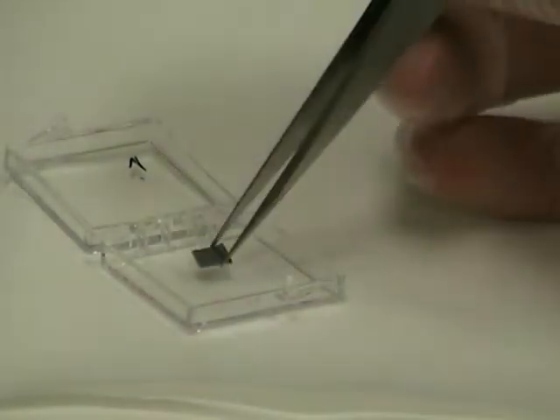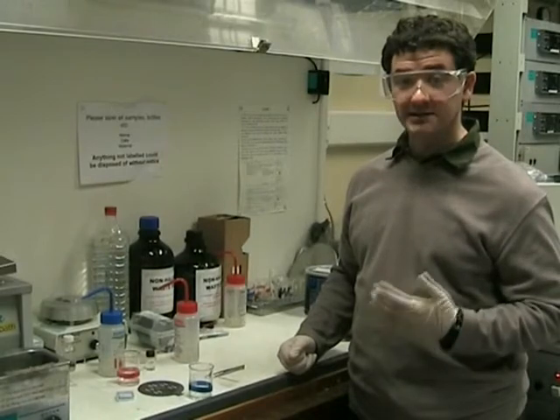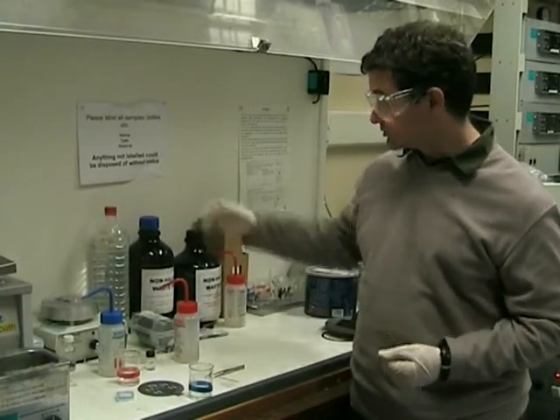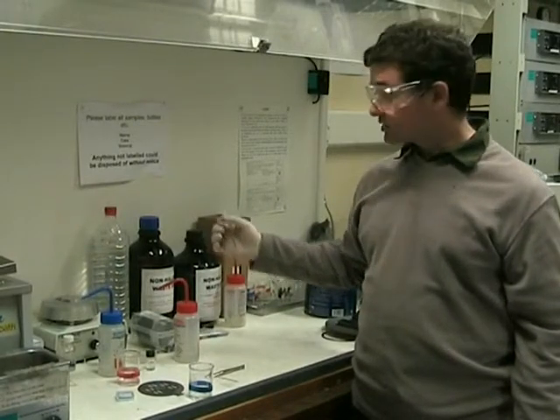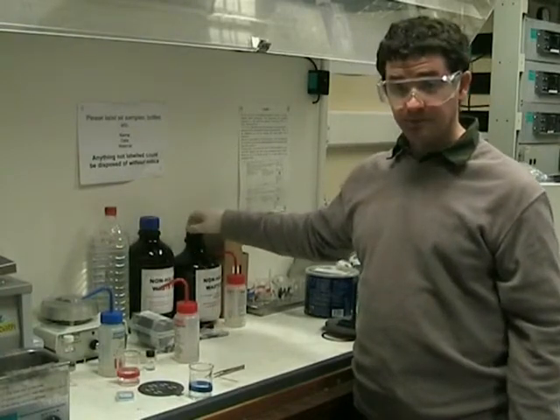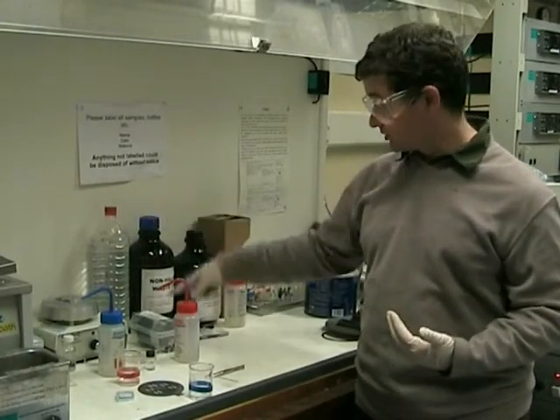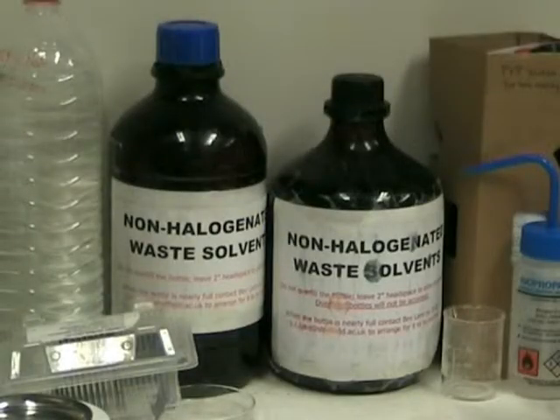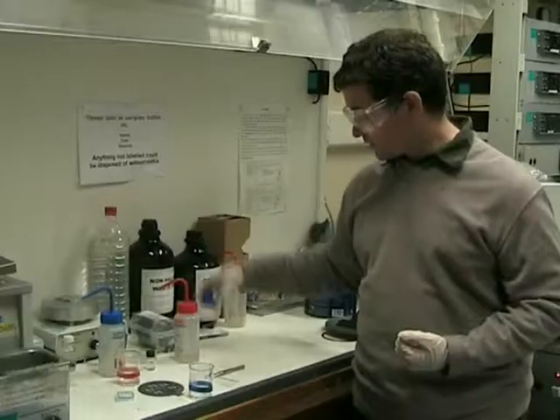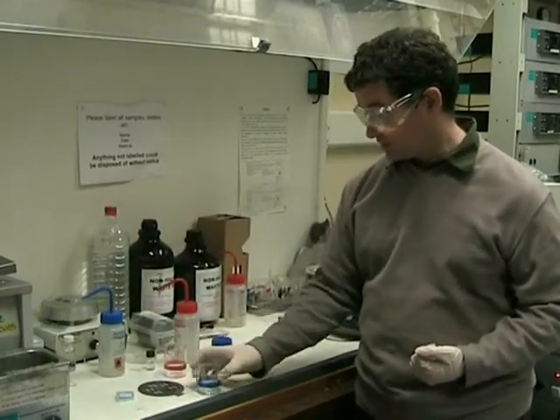After drying, the sample can be kept in its box. After we have finished, we need to throw away the waste acetone and IPA. To do this, we have two waste bottles. Try to use the tallest one first before moving on to the smaller one. If the tall one is full, contact Bev Lane at the email shown on the label on the bottle, and she can remove the waste chemicals. Pour the waste acetone and IPA into the chemical waste bottle.